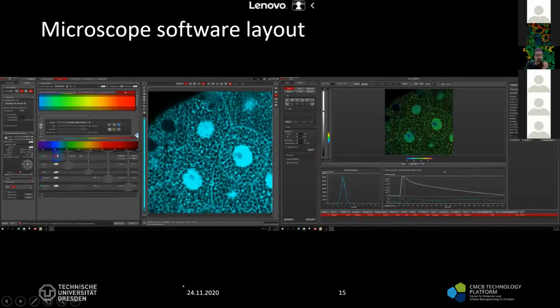Okay, so I think we had some questions in the chat. Gerhard Holz is asking, okay, it's already been responded to by Connie. The point here, Gerhard, is that this is the maximum output of the laser, and it's not what we are using. So 1045 nanometer is not the laser beam we are using for the imaging. Okay, so no more questions so far.